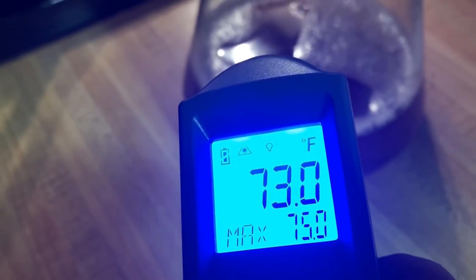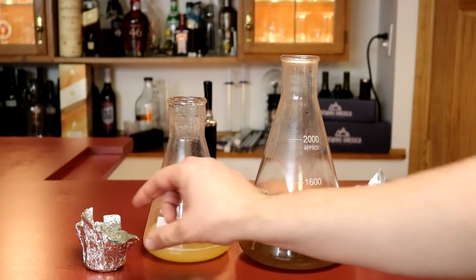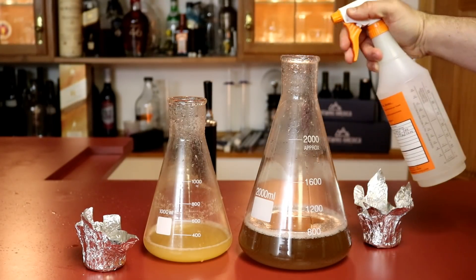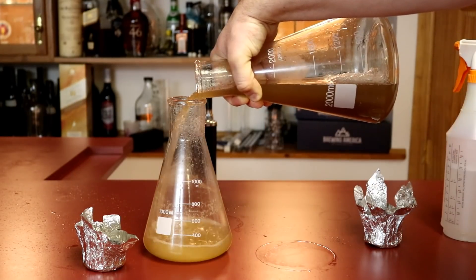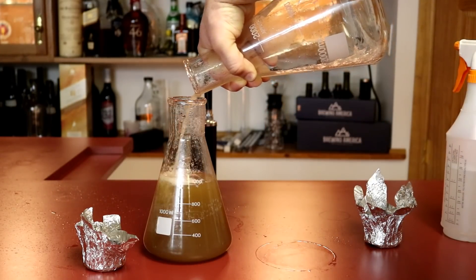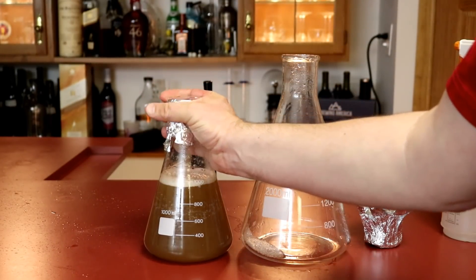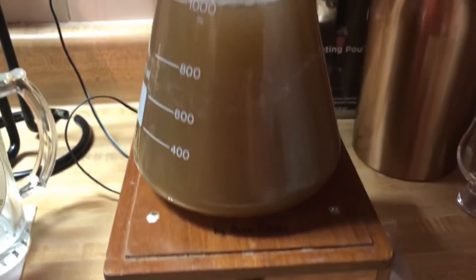I take both flasks and put them side by side, then remove the foil caps on them. I spray around the top lips of both flasks with some Star San to sanitize them. Then I swirl up the new starter and pour it into the other starter with the yeast. I add the sanitized foil back on top, crimp it a little bit, and put the newly combined starter on the stir plate.